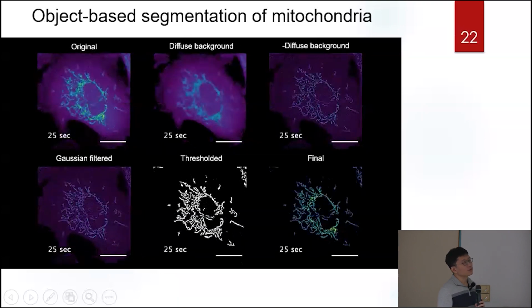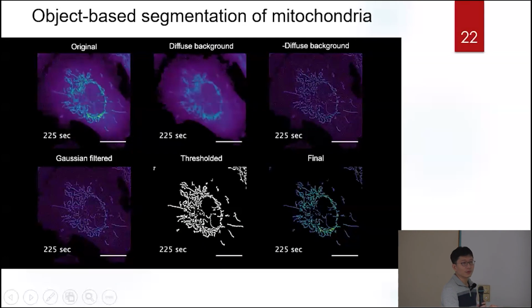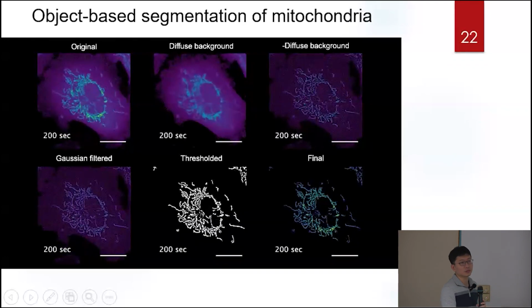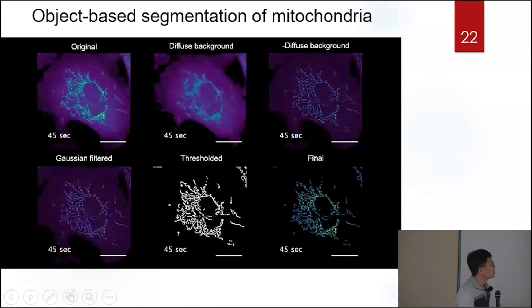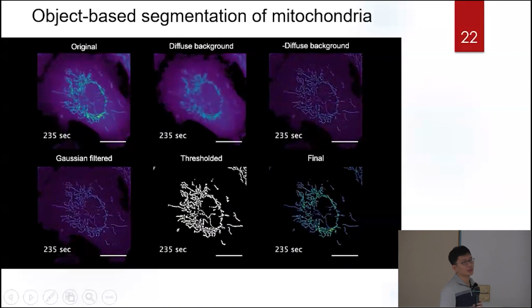So I have to say, after you apply it back, you still keep the intensity in this one, and then you can calculate. This just assigns the mitochondrial location to the original image. Okay, so then after that, you can use these segmented images and do the following analysis.